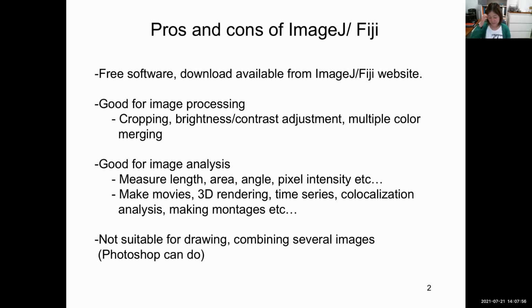The drawback of this software is that it's not suitable for drawing or combining several images. Then you may want to use Photoshop to do that.